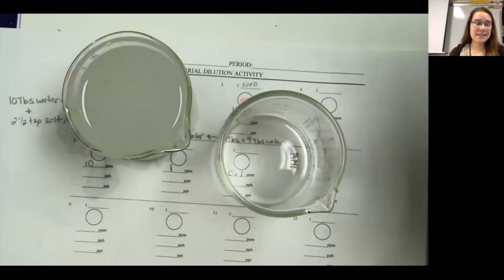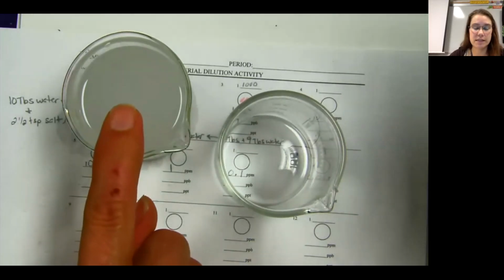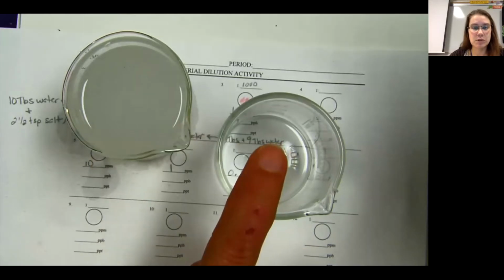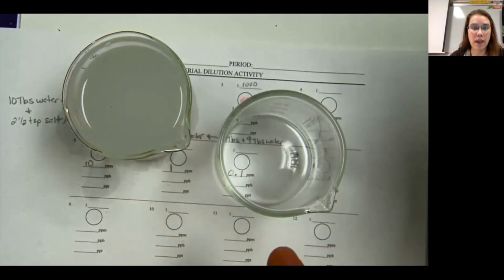So into my next container, I'm going to add 1 tablespoon of this and 9 tablespoons of water. This is going to be my 10,000 parts per million solution. I'm going to continue to do that until I get all the way diluted to 1 part per million.